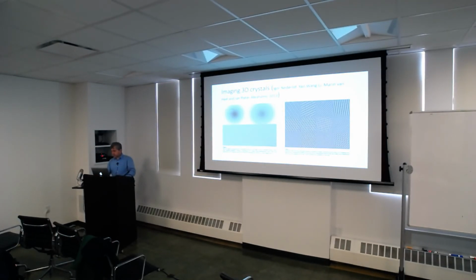Or can you just take one crystal, tilt it to the maximum, and do a tomogram or something? But then you don't need to do the whole series, you just need one image. I'm not sure how technically many phases you need. One image is only going to have a limited number of spots from this 3D crystal, so I'm not sure how many estimates of the phases you need to start with, whether one plain image is enough.